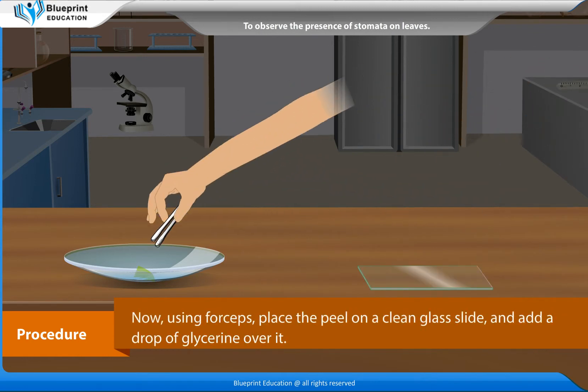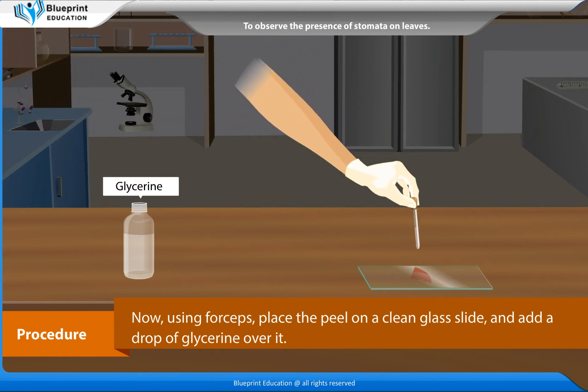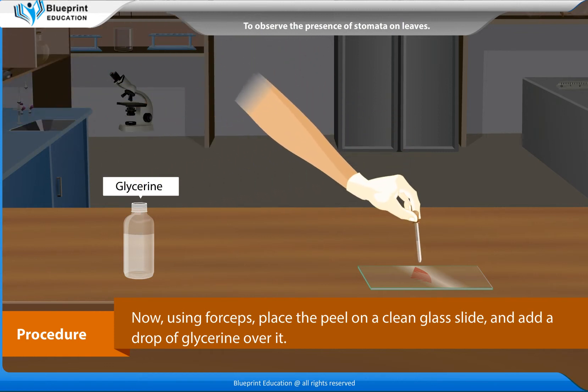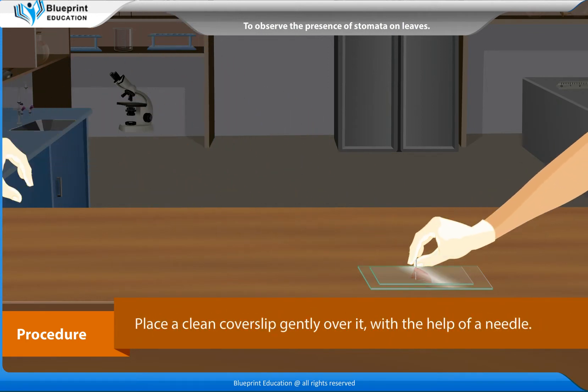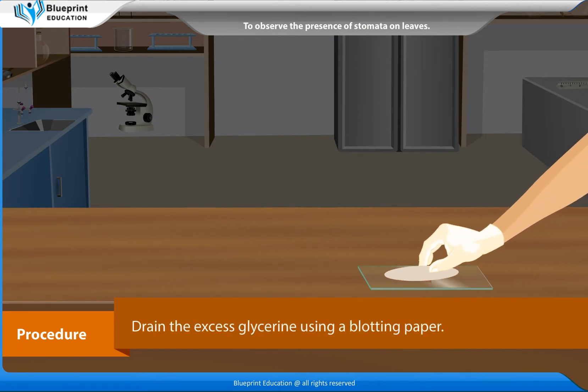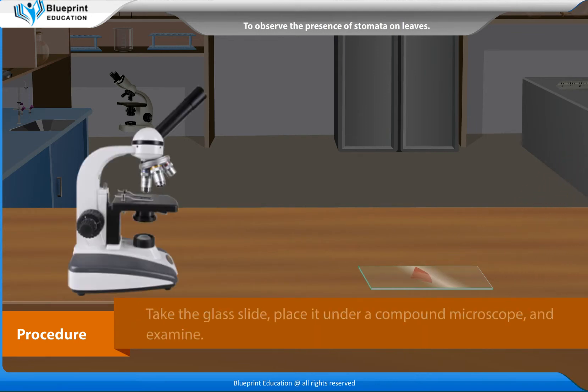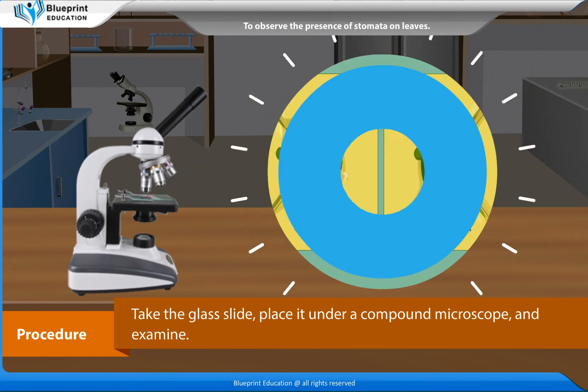Now using forceps, place the peel on a clean glass slide and add a drop of glycerine over it. Place a clean cover slip gently over it with the help of a needle. Drain the excess glycerine using a blotting paper. Take the glass slide, place it under a compound microscope and examine.